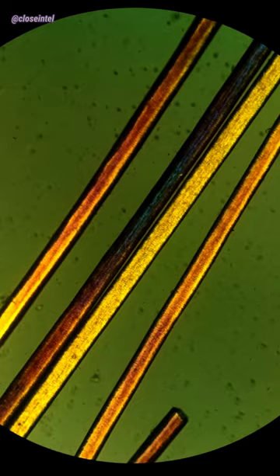I've showed hair in a video before where I showed the effects of Drano, but I didn't zoom in very close. All of the shots you see are in polarized light.